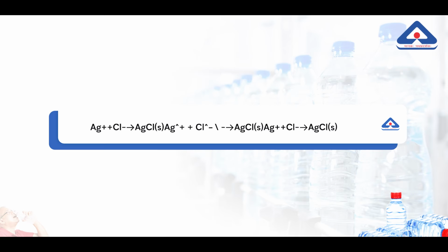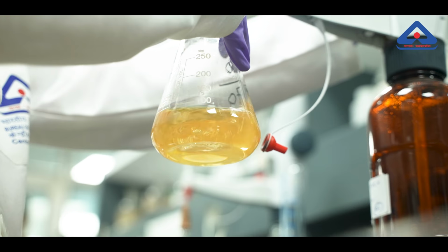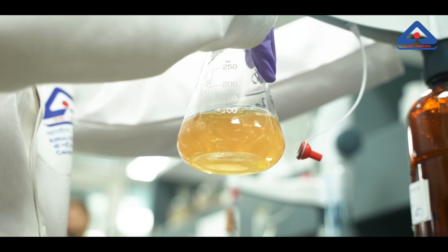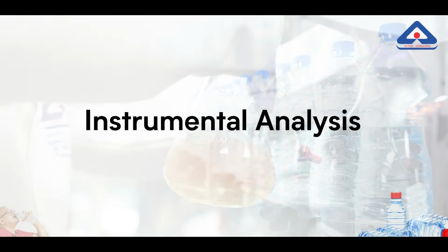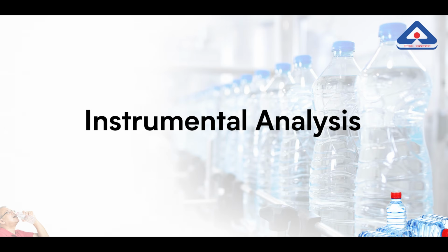During the titration, silver ions react with chloride ions in the water. This reaction continues until all chloride ions in the sample have reacted with the silver nitrate. The end point is reached when the solution turns from yellow to reddish-brown, indicating that all chloride ions have been neutralized. For the remaining parameters, we'll categorize them based on the instruments used for testing.